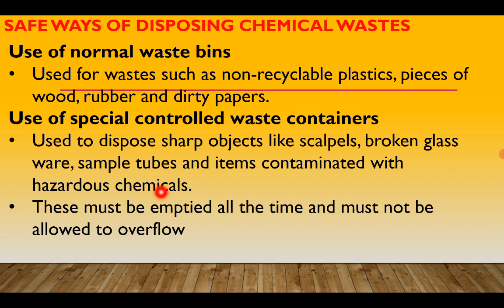The containers must be emptied all the time and must not be allowed to overflow. The one responsible will carry the container and dispose of the contents at maybe a landfill or a place chosen by the school for disposal of waste. So you take the container and empty it there. Don't allow the containers to overflow while they are in the lab.